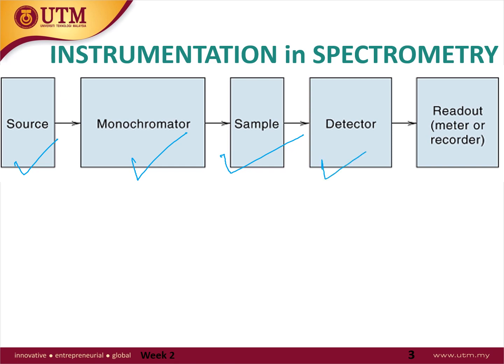Next we have the detector. What kind of detector? Is it a CCD? What else do we have? PMT and so on. This detector will detect whatever is left, and then you will get your readout on the PC monitor.